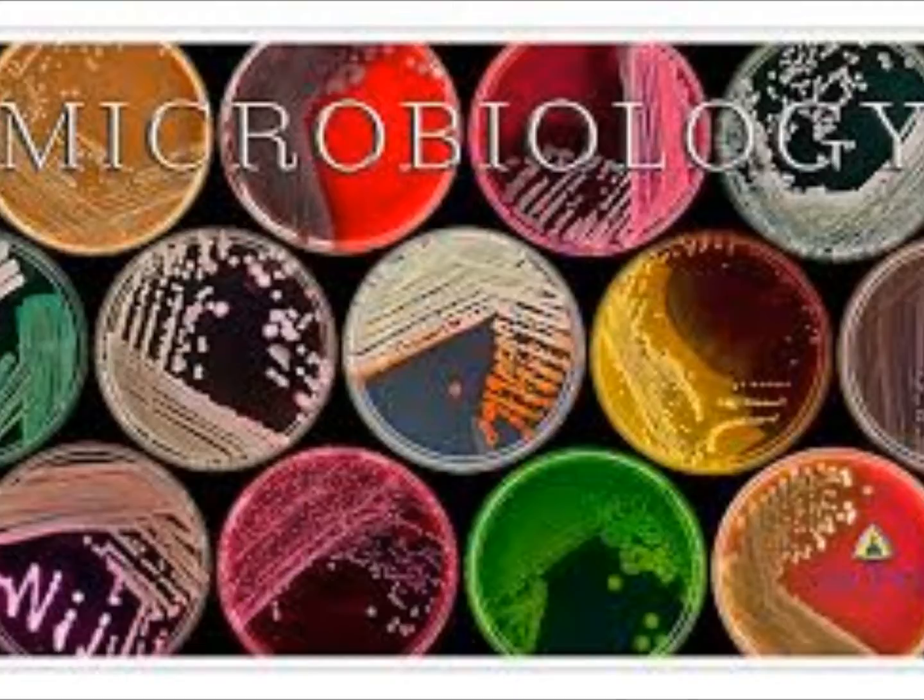You're going to pick up a colony of the organism and emulsify that in the saline. I just have DI water at their desk, and that's fine too. DI water will work. There's a tube of water at each desk with a black cap.